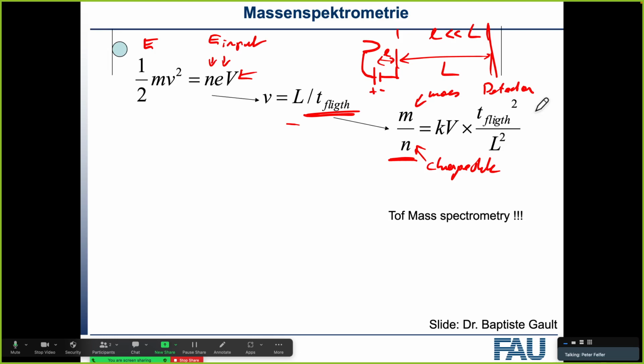And we should maybe redo that properly next time, so that this doesn't confuse you as much. But the important thing is the flight time goes in square, which later is important when you see mass spectra, because what that means is that time bins at small mass to charges account for larger parts in flight times. So if you have hydrogen with a mass to charge of 1, then the area there counts from maybe 50 to 55 nanoseconds flight time.